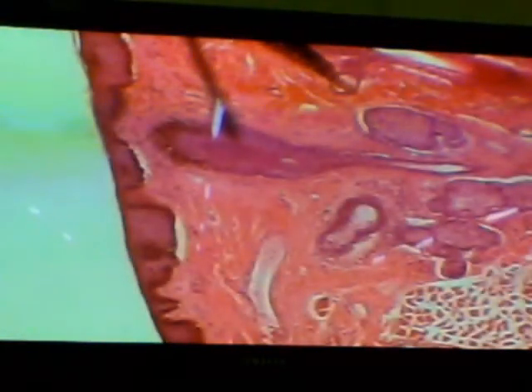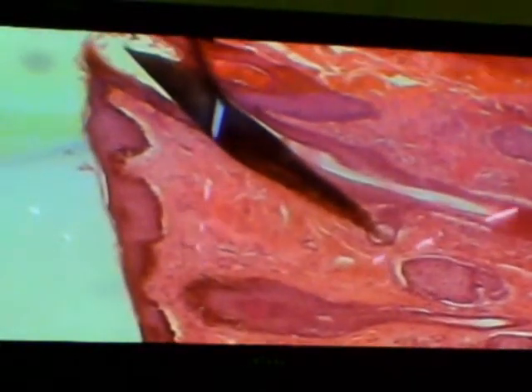All right. Right on the edge, we have some. Let me get down to a lower power. And what is that underneath the pin? On the edge of the thing. What is being pointed at there? On the pointer. I guess you have 2 pointers. Or what is this dark one? Hair lash. Right, the hair lashes.